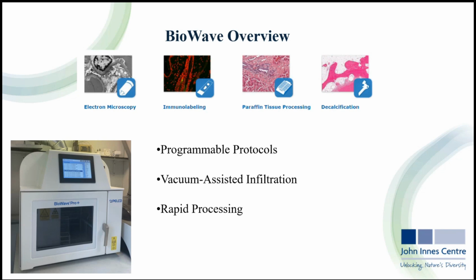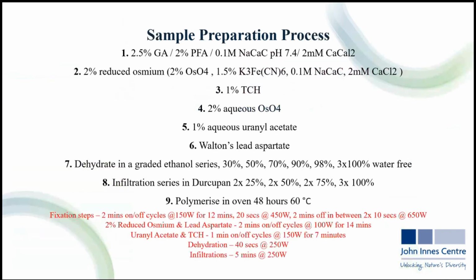samples. While we primarily use it for plant tissue embedding, it has many other applications such as immunolabeling, paraffin tissue processing, and decalcification. Let me just show you how we've been using the BioWave in our study to try and optimize the embedding process.